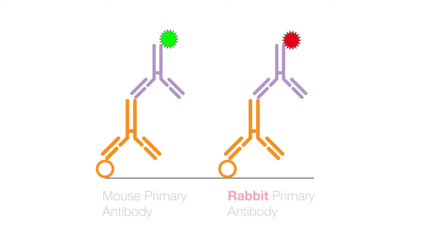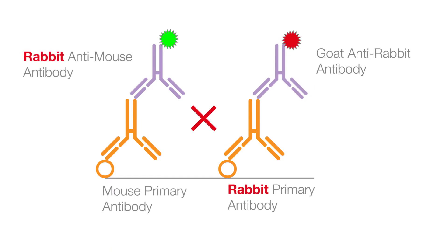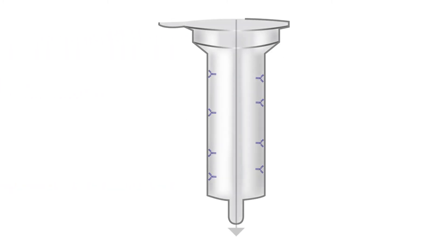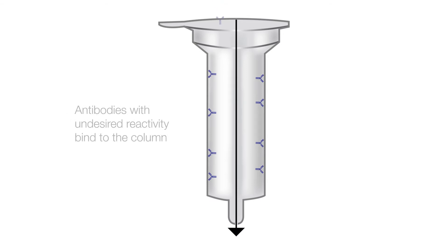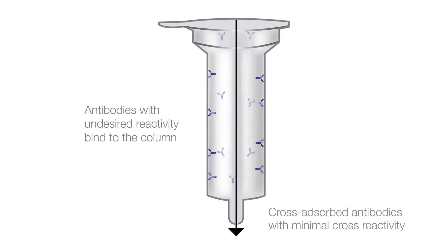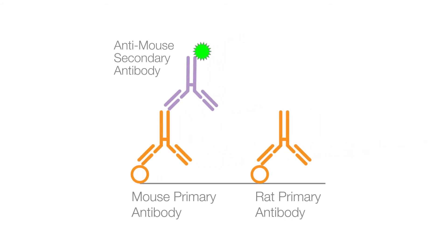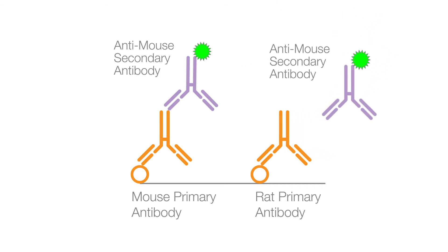Do not use secondary antibodies raised in the same species as any of your primary antibodies when using a species-specific approach. Ensure specificity of your staining by using cross-adsorbed secondary antibodies to prevent cross-reaction with the primary antibody. The cross-adsorbed antibody will correctly bind the target primary antibody but will not cross-react with the primary antibody from the related species.